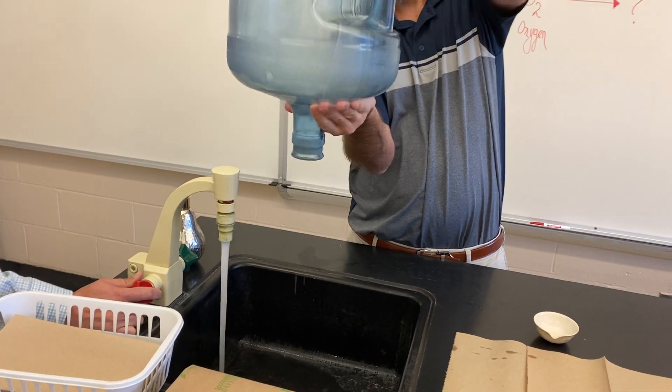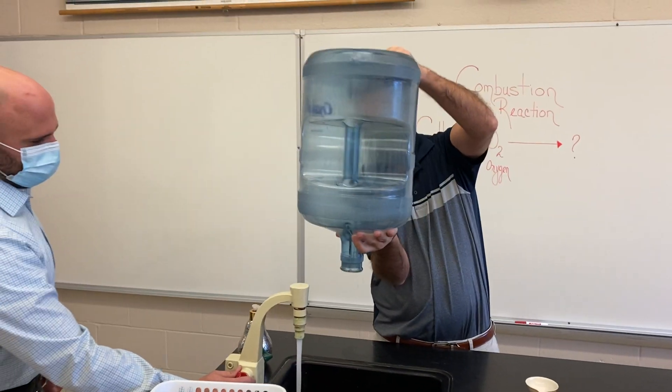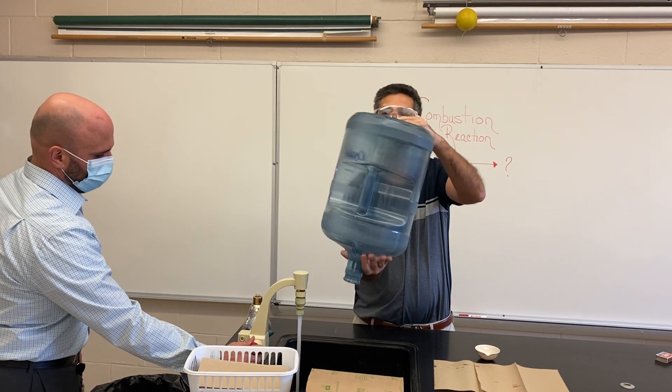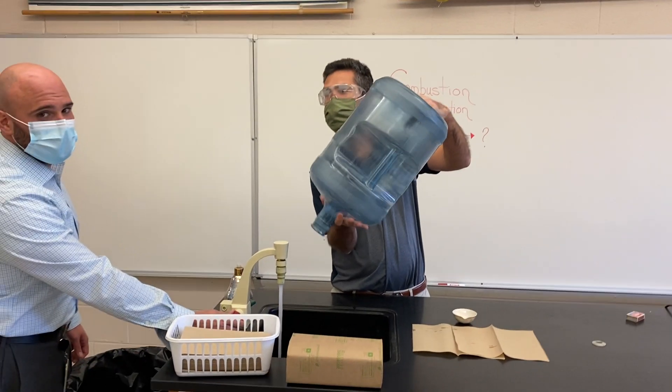It takes a couple seconds to do this. You guys should all know that ethanol is flammable. Flammable means that if you put a match to it, it will ignite. So don't do this at home.